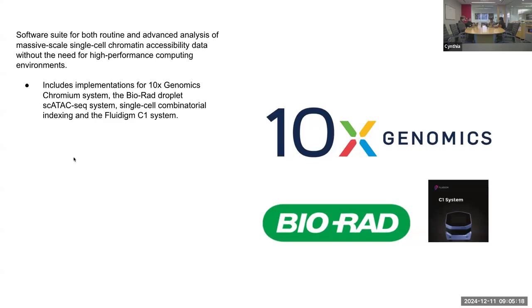The implementation that this team did includes the 10x Genomics systems, but also the Bio-Rad droplet single cell ATAC-seq systems, as well as single cell combinatorial indexing and Fluidigm C1 systems.